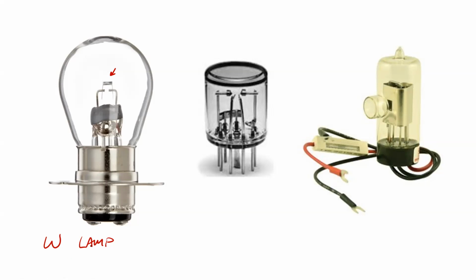grating. Let's switch now all the way over to the one on the right that looks kind of like a minion. Which one did we say that was? Deuterium. Yeah, that's our deuterium lamp. And so inside this nice little metal box here is the deuterium light source. It's a spark, not a spark, it's a discharge light source.